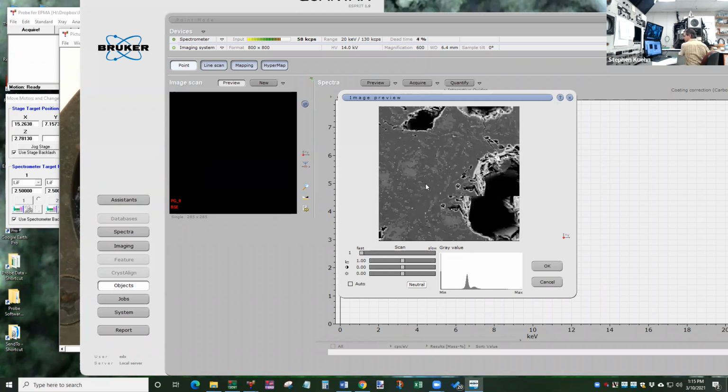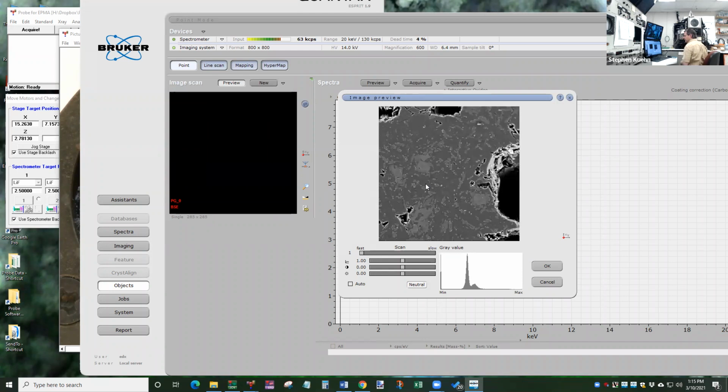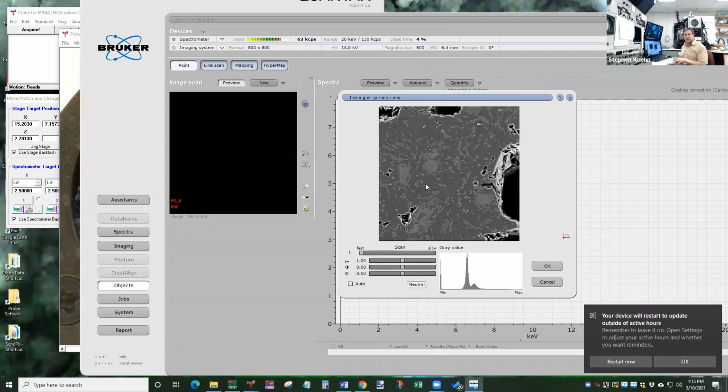So there's more of that area with the microscopic crystals. We call that the matrix. If you have a rock with big and small together, the big crystals, if it's an igneous rock, would be the phenocrysts, and the tiny ones in between would be the matrix. So this has big and small crystals together. So we just learned something about the texture. This rock is porphyritic. We probably want to write that down too.